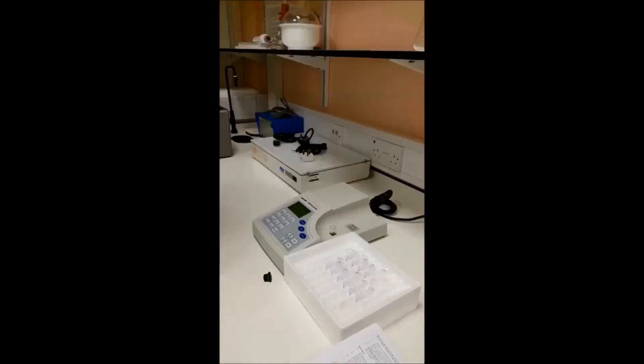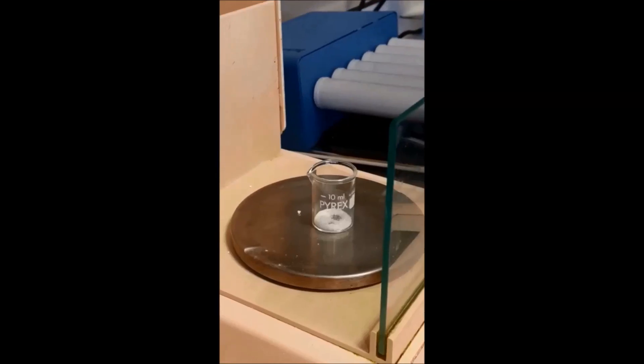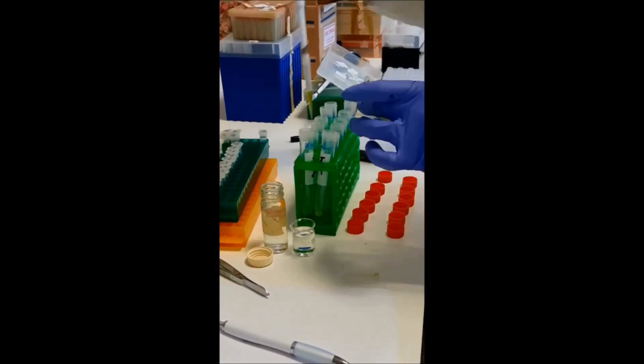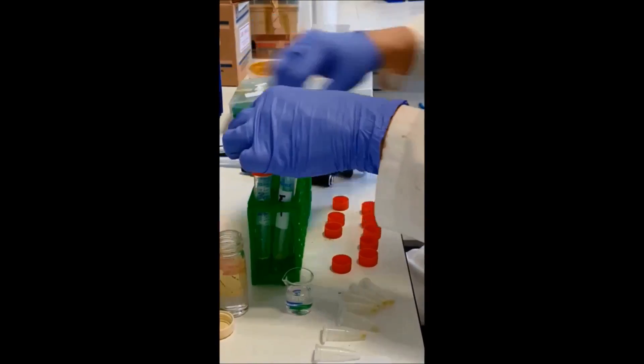We measure the color intensity using a machine called a spectrophotometer. Next, we add a chemical called hydroxyl amine to the proteins, which removes the chemical switch from a protein.